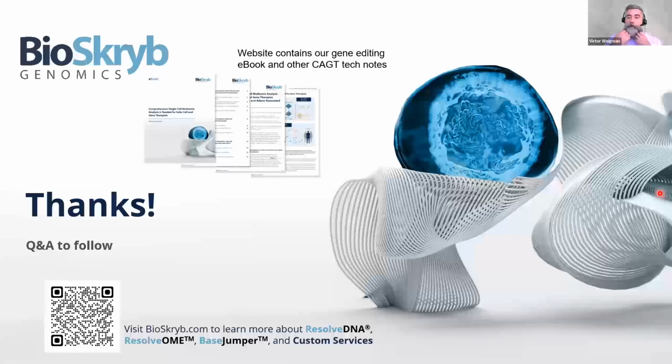And the off-target events for that, which I mentioned earlier, even for our CD34 hematopoietic stem cell, or cord blood rather, the off-targets were still in the over 1,000. Whereas, and I didn't show this because I didn't want to overwhelm the audience with too much data, when you start looking at the VEGF-A, the less specific editor, not only was its incorporation at 20 and 40% of the cells, independent of the cell lines, its off-target copy numbers and translocations were double that of the specific one, and its off-target indels were also vastly more than the precise one.